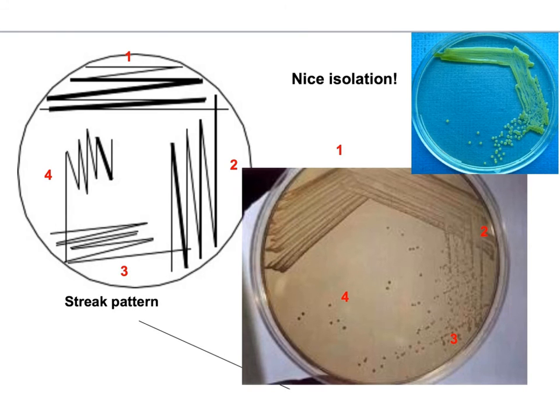In order to get that single bacteria colony cultivated on an agar plate, we need to learn how to properly streak the plate. There are many ways to streak the plate. We can streak in four sections or in three. In my labs, I do tend to go with the three-streak method.